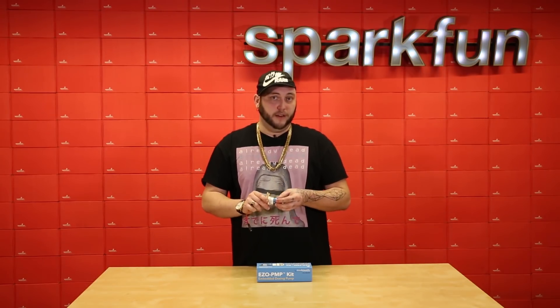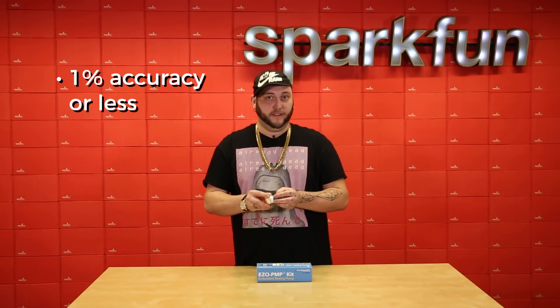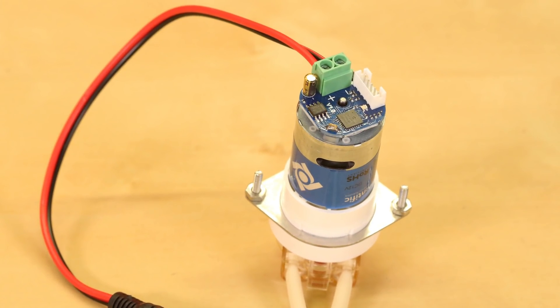With that calibration, you can dispense fluids with 1% accuracy or less. Without calibration, that goes down to about 5%.